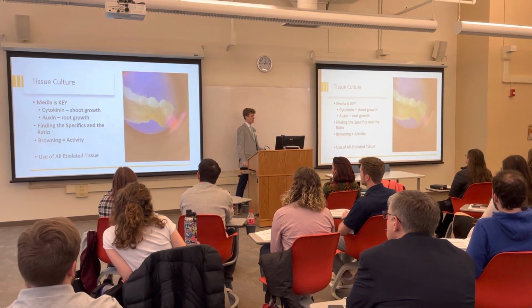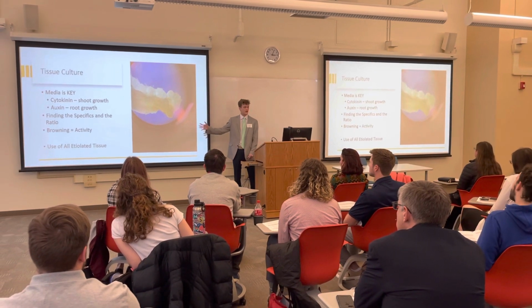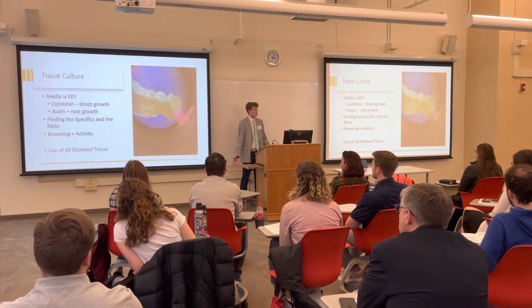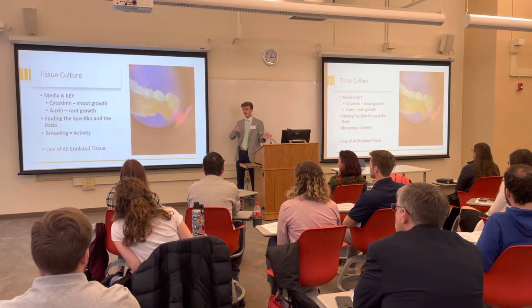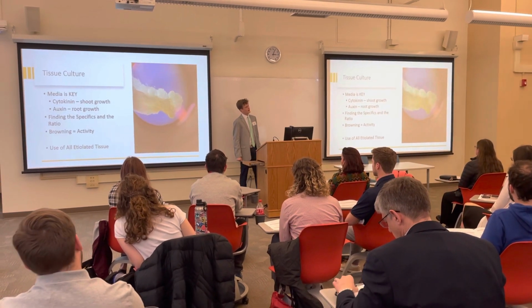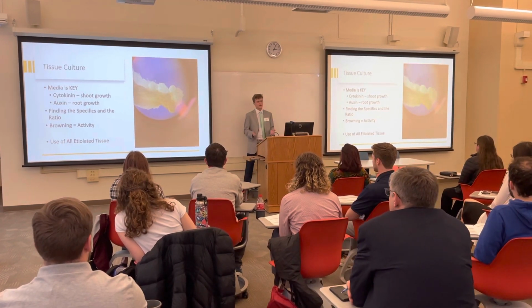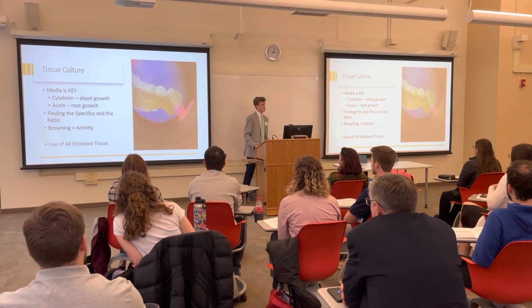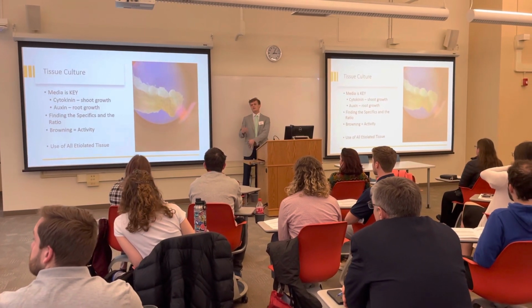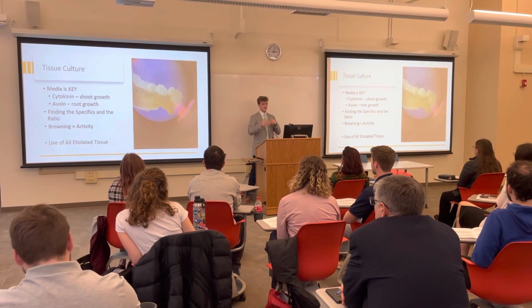In tissue culture, your media is key. There are two key hormones to tissue culture, cytokinins and auxins. Cytokinins produce shoot growth, auxins produce root growth. We want to find that specific ratio, what makes a good shoot versus root dynamic here. Classically, you're going to have browning that is going to indicate usually negative activity. We don't love browning. It sort of gets in the way, so that is something we're going to study here and see what is that perfect balance between browning and callus tissue formation, which is the first step of creating a tissue culture.